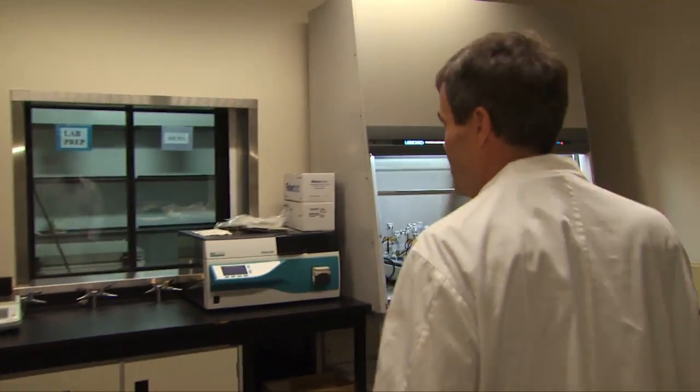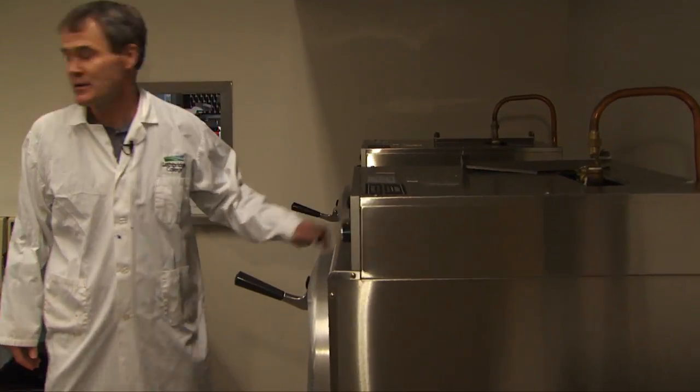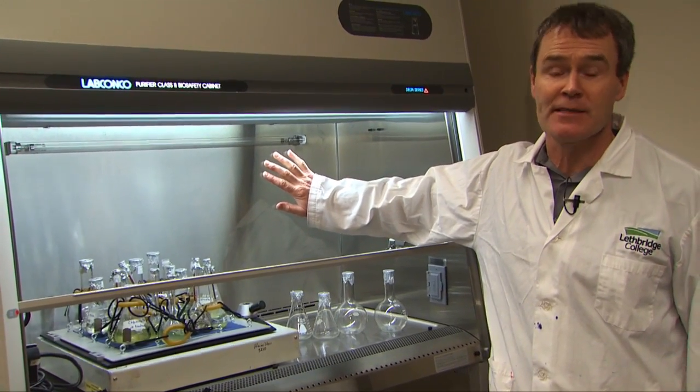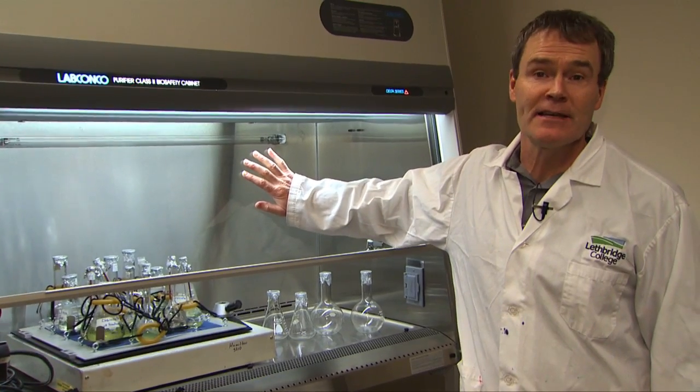This is our prep section — we get set up in here and it has all our media prep. We have two large-scale autoclaves and a tabletop autoclave. What we have here is a biohazard hood where we're growing algae. We use that algae to help sequester CO2 and produce certain products like oils or biomass that we can actually utilize in other applications.